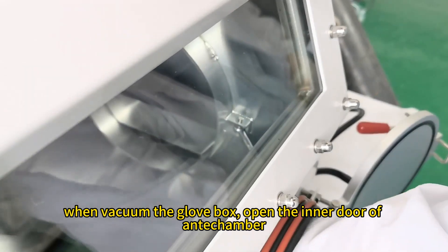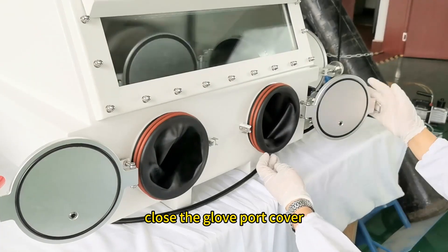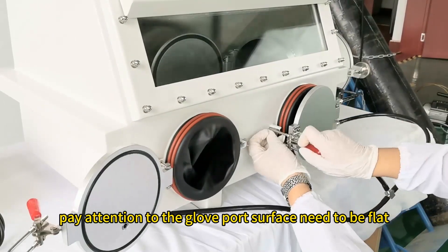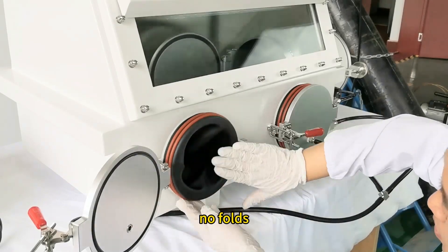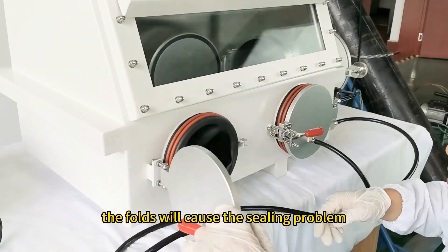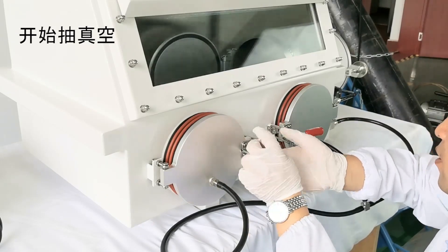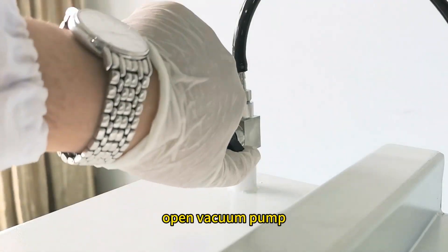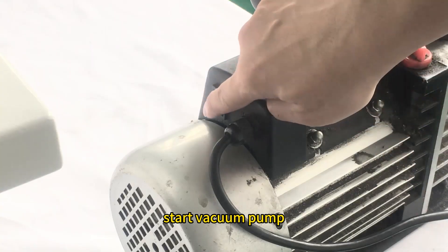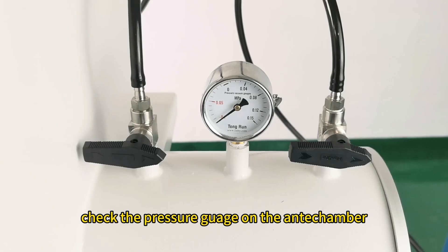Press to open the inner door of the antechamber, then close the glove port cover. Pay attention: the glove port surface needs to be flat with no folds, as folds will cause a sealing problem. Open the balance valve, open the vacuum pump, start the vacuum pump, and check the pressure gauge on the antechamber.